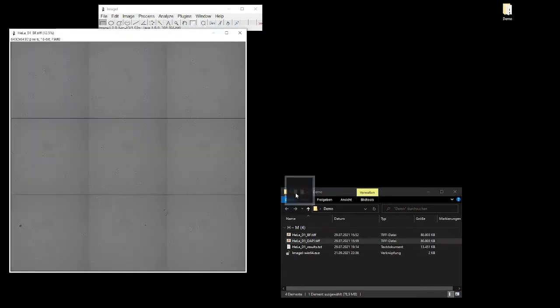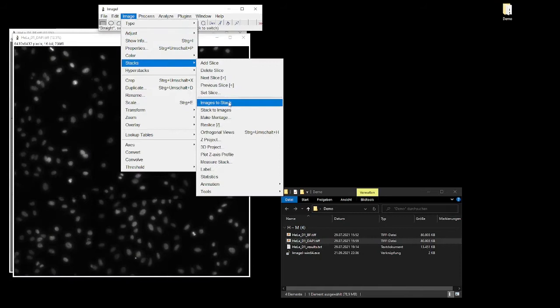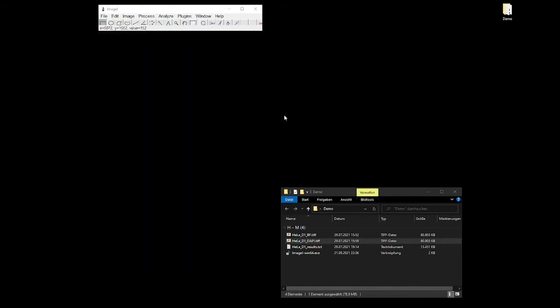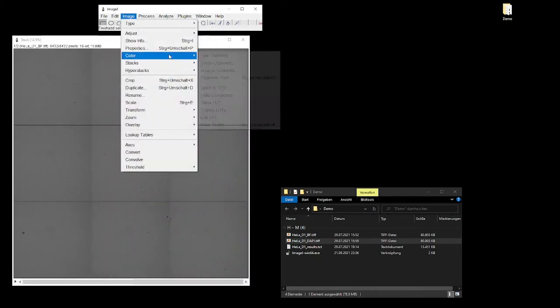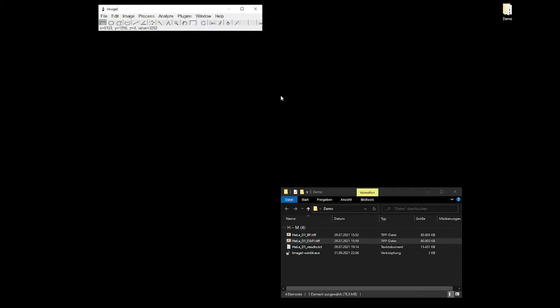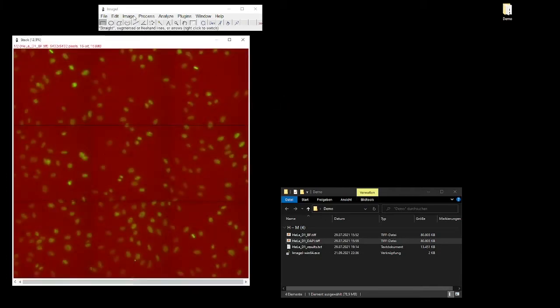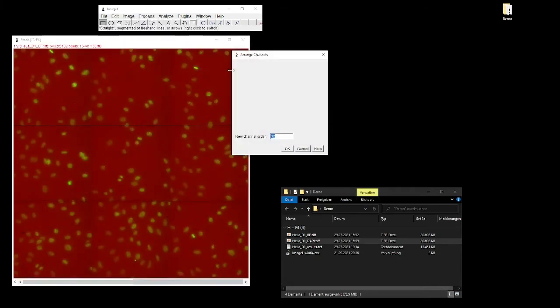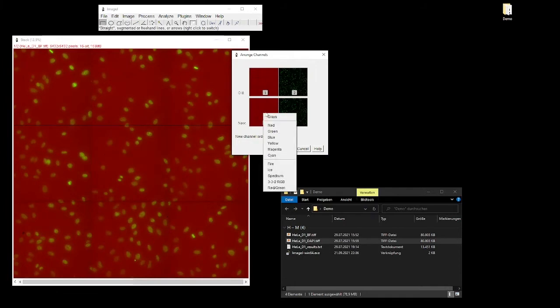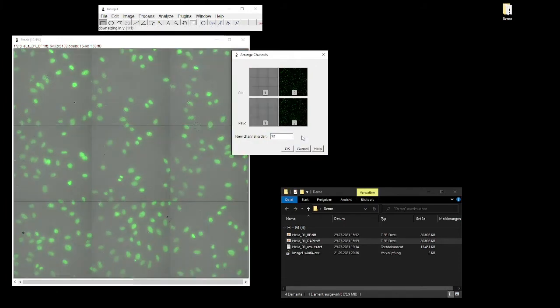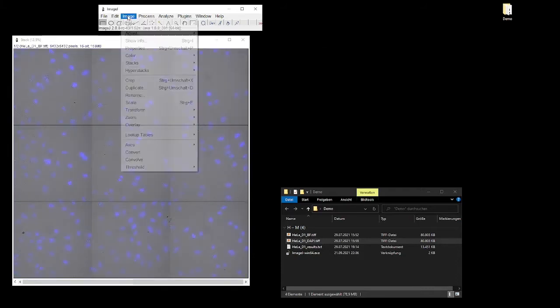Now I will walk you through the ImageJ plugin to get an idea how this is technically done. First we will open ImageJ and then we will load the brightfield image and the DAPI image. These two images can be converted into two stacks. One channel will be converted into grayscale and the DAPI channel will be converted into blue.